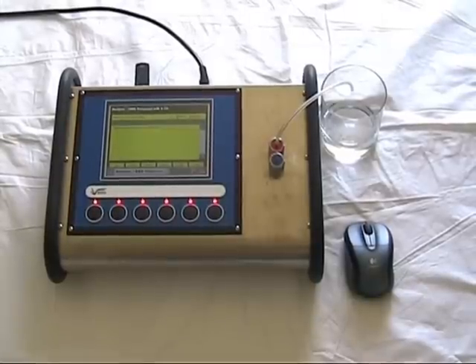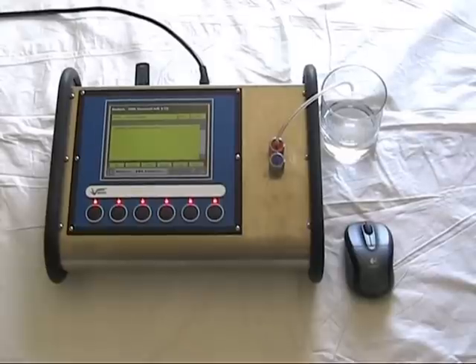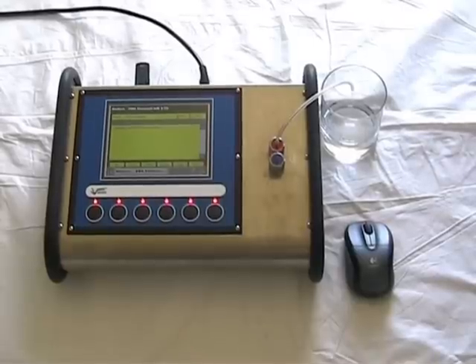This is the Myris Dairy Milk Analyser. It analyzes milk samples for fat, protein, lactose and total solids.